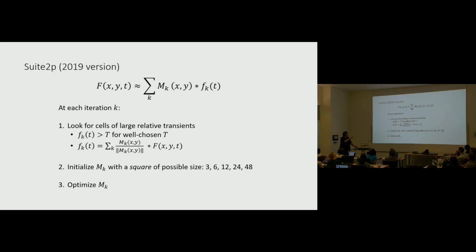OK, so what we've done is we've had a good guess to start with of where there might be a cell because on a frame it was bright. And so now we've initialized a cell with that guess and optimized it properly to minimize our cost function, our matrix factorization. If we do that properly, then we'll be matching as much in the raw data from the cell as we can, right? Every pixel will be hopefully scaled the right amount of the fluorescence of that trace.